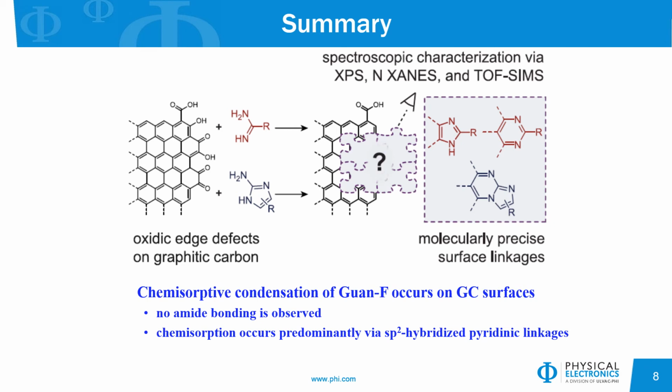It was initially assumed that there would be no oxygen observed in the condensation linkages, but what we have been able to see, because the tandem MS measurements were so sensitive, is that there are some precursors that do contain oxygen, and therefore we know that the condensation reaction is not 100% efficient in the evolution of water because there is some remaining oxygen in those bonds.